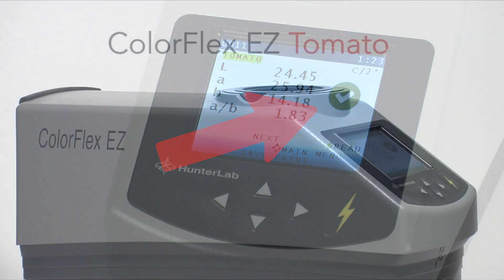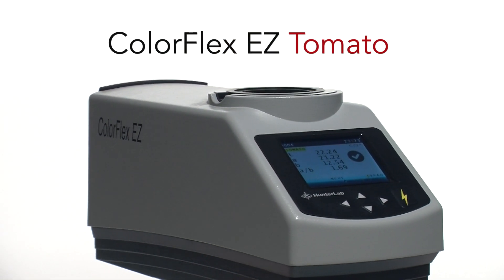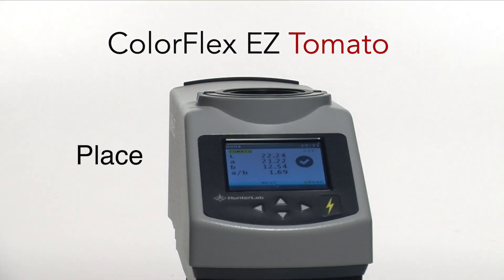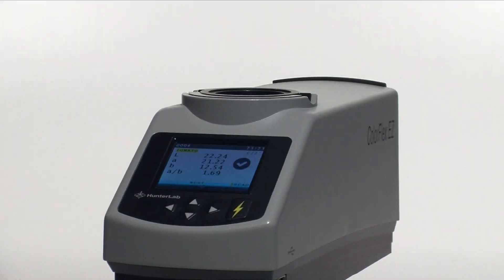The ColorFlex EZ Tomato gives you the most efficient process for measuring the color of tomato juice in the industry. Pour. Place. Measure. It's that easy — and only from Hunter Lab.